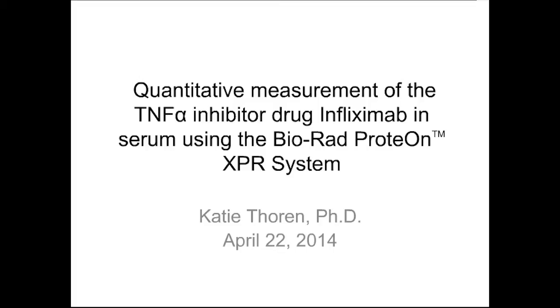I hope to give you a general overview of how SPR might be used in the clinical lab and provide also an overview of some of the things that you should think about when working with a complex matrix like serum.